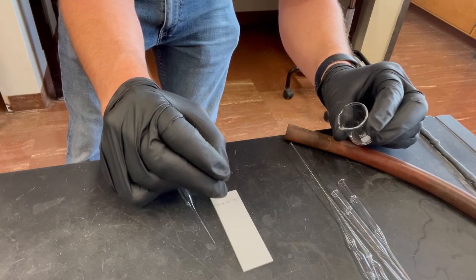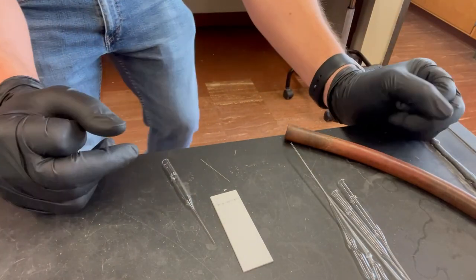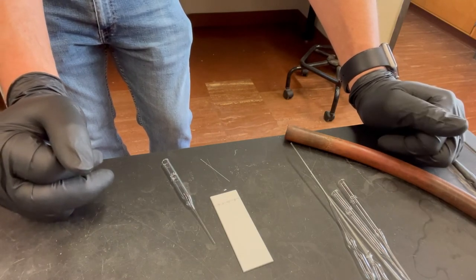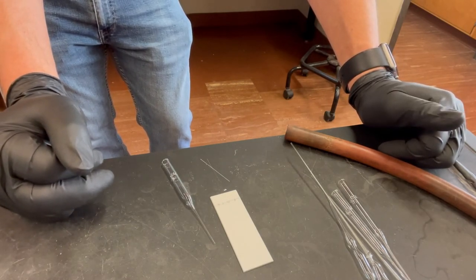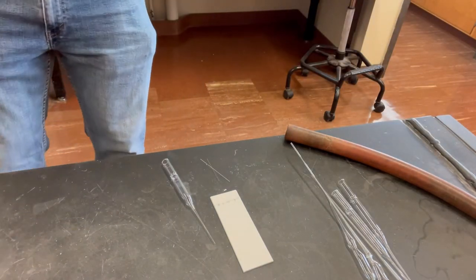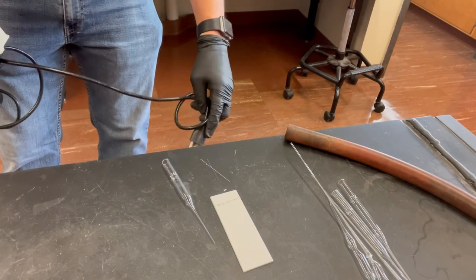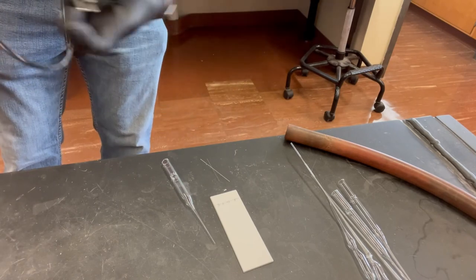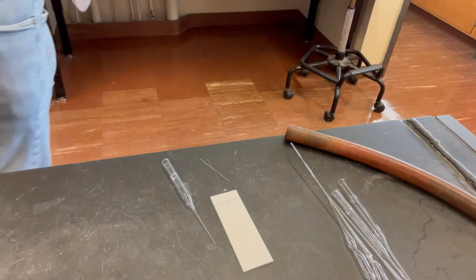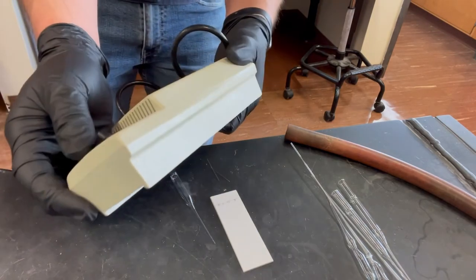For me, I am kind of systematic and weird. I like to count how many spots I do. So I did probably 10 on that one. So I know, okay, I did 10. And if I determine that it's not very concentrated, then I can say, okay, we'll do 10 more. Or if it was decently concentrated, but I still need a little more, I'll do 5 more. That's just how I work. I think that's a suggestion to keep things organized, and maybe it'll work for you, maybe it won't.